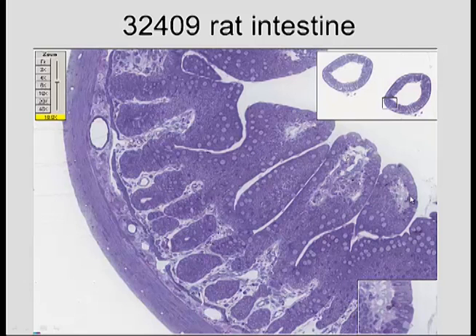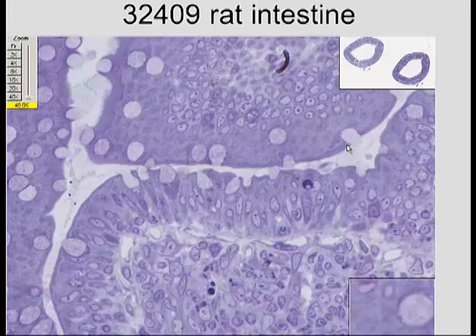But here we might be able to see some that are cut along the length of a cell, goblet cell, intestinal absorptive cell, and here we can see the same thing. These are intestinal absorptive cells in through there with connective tissue down below. This darker tissue right in through there is smooth muscle, and this is smooth muscle there. Large blood vessels in through there, connective tissue in through here, and intestinal absorptive cells lining the lumen.